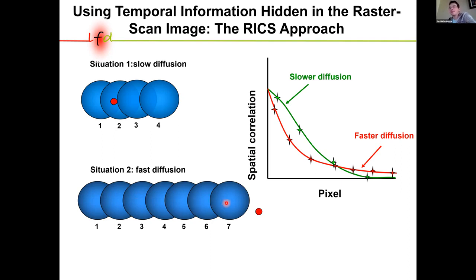Of course, you have to take into account that this is a statistical method. For example, in the case of free diffusion, there's no reason that the molecule shouldn't go in the opposite direction as the laser beam. And of course that happens, but we are considering many molecules. So as an average, there is a certain probability that it will go the same direction as the laser.